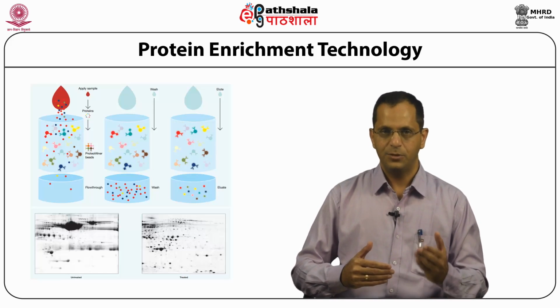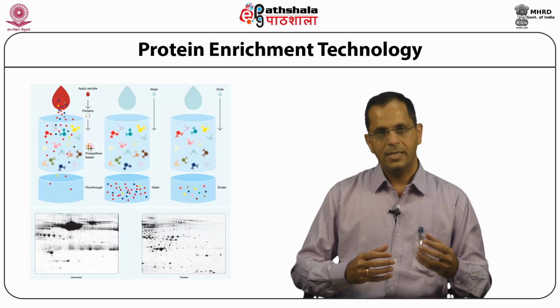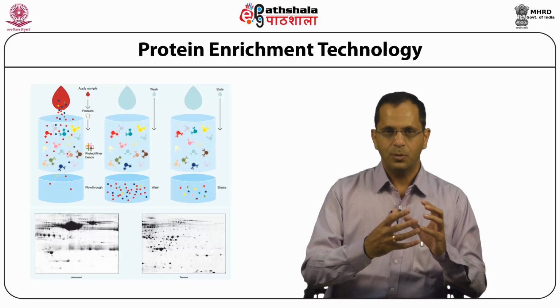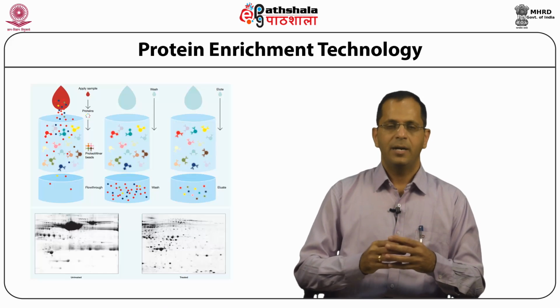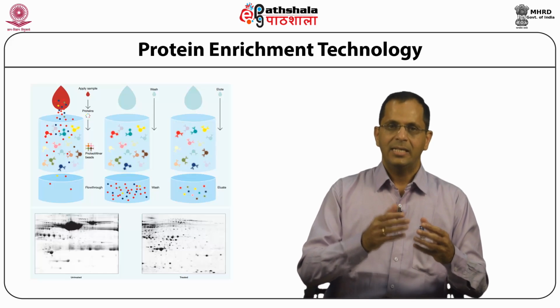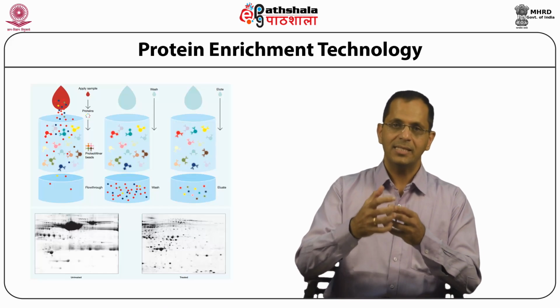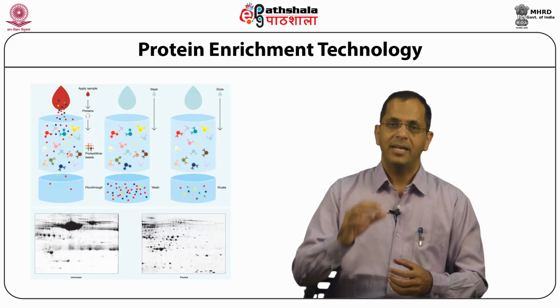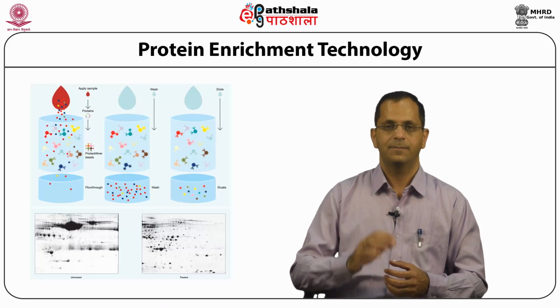So in the figure, you understand that you load a particular protein, there is a binding of these proteins to this library of peptides as you see in the middle column, and when you finally elute out the proteins that are bound to these ligands, you would have essentially decreased the dynamic concentrations of the proteins.